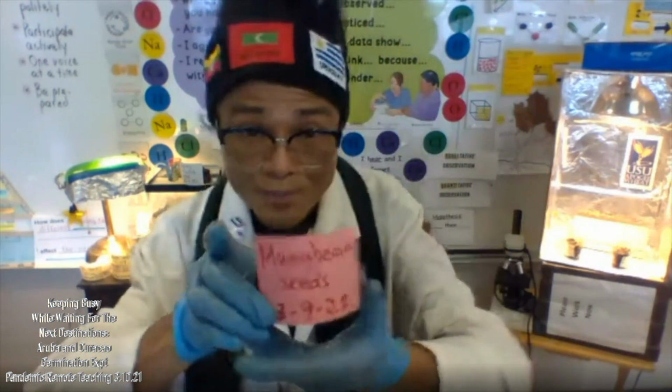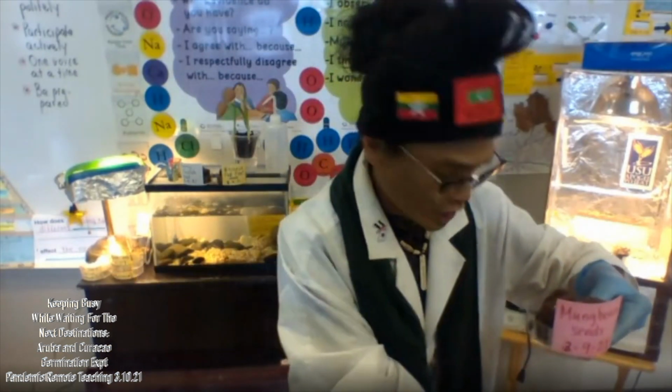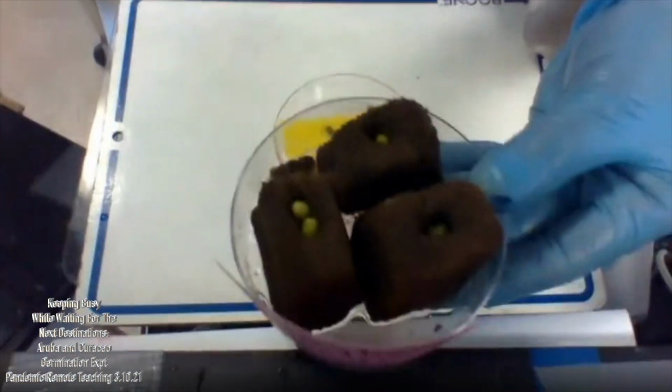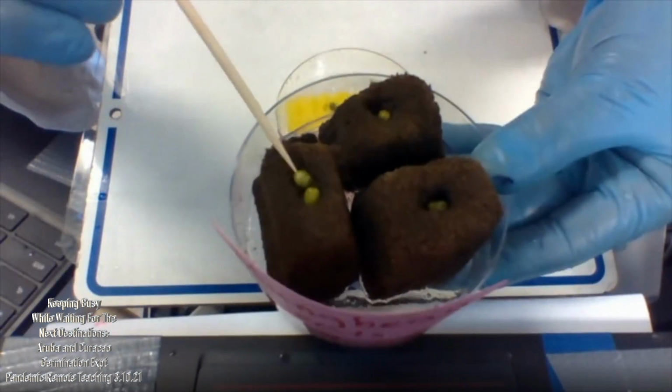I have the mung bean. Could you tell me if they are showing some signs of germination? Let's take a quick look. So this is the mung bean. I'm going to focus one or two of the seeds and tell me if they appear bigger than yesterday. Okay, here is the mung bean. Is it bigger than yesterday?